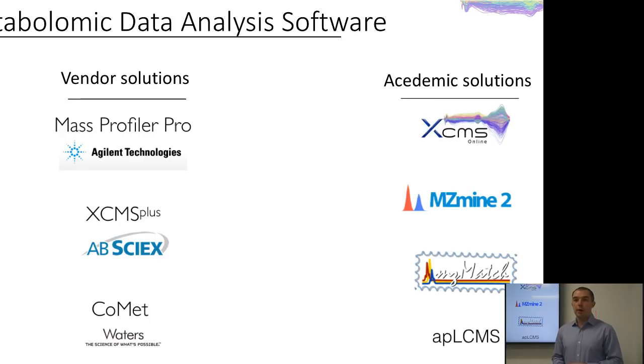We're going to talk about XCMS and XCMS Online because, well, for myself, I'm a developer, and XCMS Online, of course, is developed here at the Scripps Research Institute.